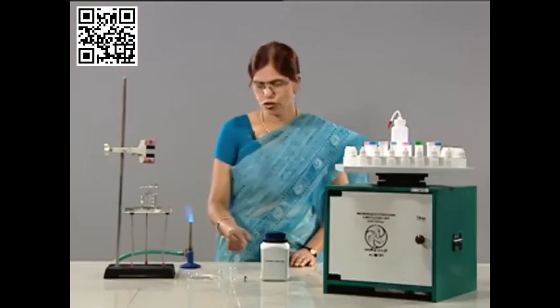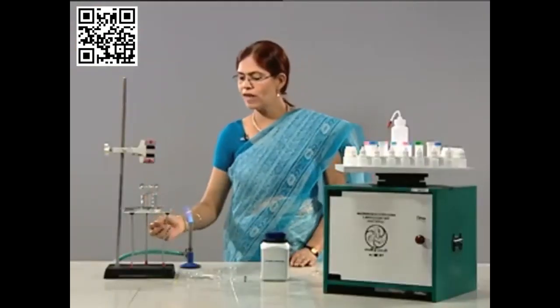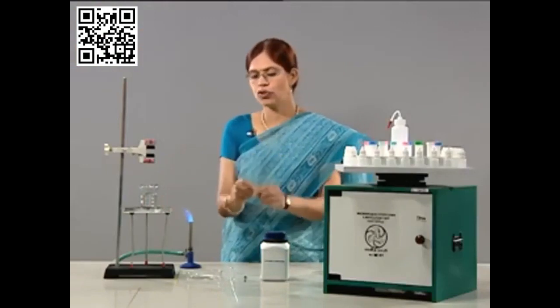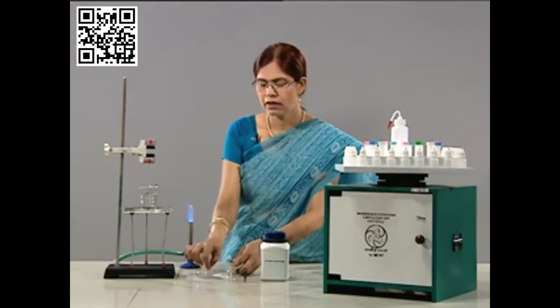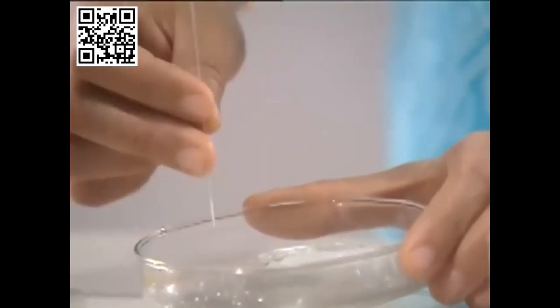Take a capillary tube, seal one of its ends by inserting it into flame, and don't forget to rotate it continuously. Now, this sealed capillary tube is filled with the chemical, that organic compound which you need to determine the melting point.